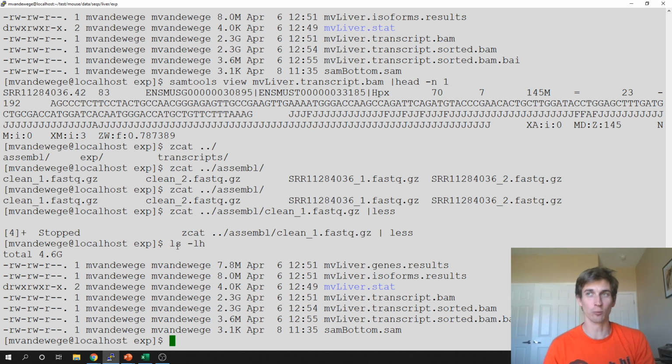There are several different ways to sort something that we don't need to worry about. But sorting is always important because how we sort our BAM file is not based off of what read went where, but it's looking within a gene and mapping out and telling us which reads map to gene 1 position 1, which reads map to gene 1 position 2, etcetera.